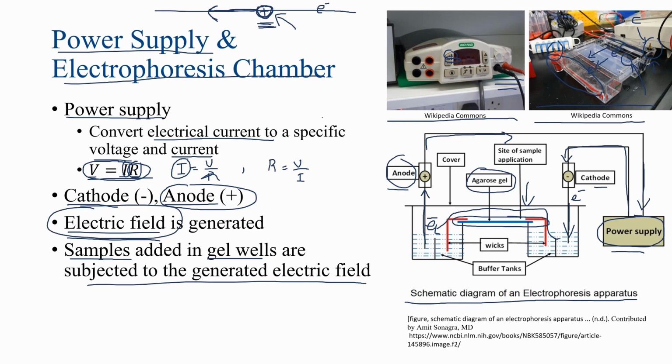So when we discuss an electrical field, let me draw a simple electrical field for you. Let's say we have a positively charged molecule here, or ion, and we have a negatively charged molecule or ion here, and they produce an electrical field. In physics, the directionality of the electrical field is drawn out in a diagram as if you're dealing with the movement of a small positively charged particle. So for example, in physics, if you were to draw an electrical field here, the lines would be pointing this way, just like this, towards the negatively charged part.